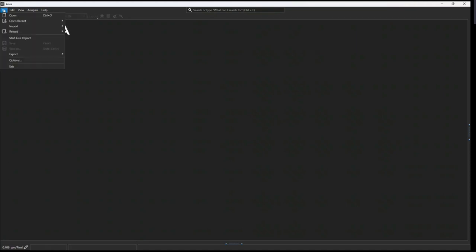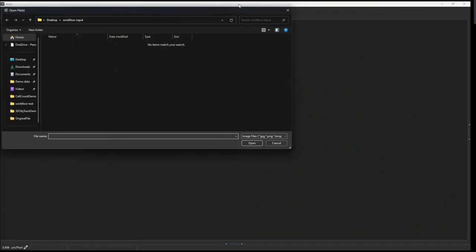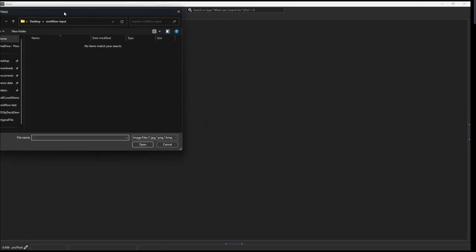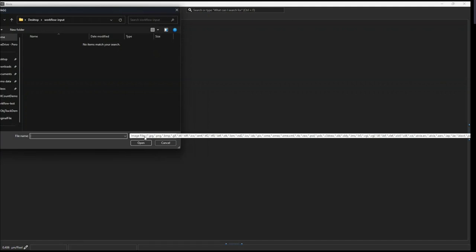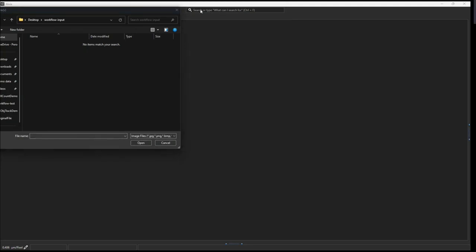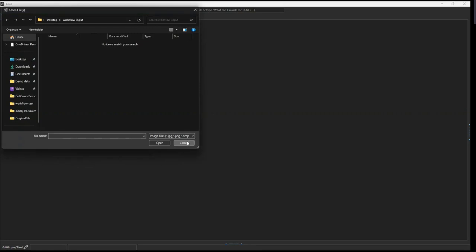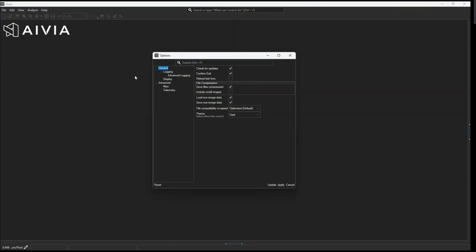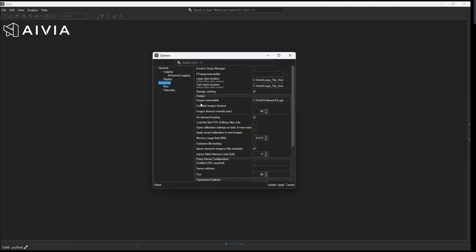One question was about file formats accepted in Avia. Under File > Open, there is an extensive list of image formats that can be loaded. I also mentioned the ImageJ/Fiji open microscopy environment bioformats importer. When you first set up Avia under the Advanced section, you have the option to add your ImageJ executable, which can then help you launch data that is not natively read.